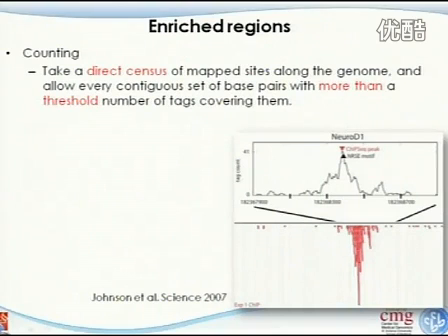Okay, so the first step is to look for the enriched regions. And this is very straightforward. So you see, I'm bringing up this picture again. So you see this is one region that you identified a lot of signals, and then you want to plot in this way. So each Y here corresponds to the number of reads you detected in that particular genomic locus. So you see there's a strong peak around this region, and that tells you, oh, there's a binding site.